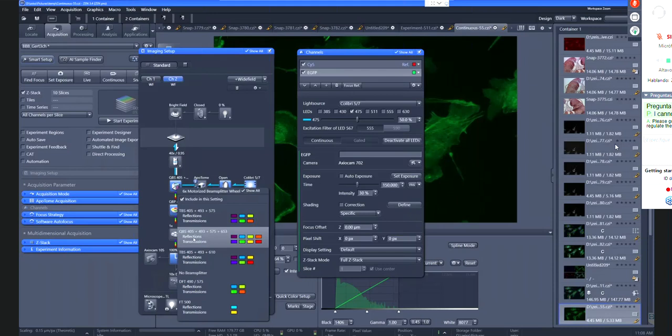Thank you, Kel. So we'll do one last question as we're already over time, which is basically two questions, but for one topic. Can you explain binning further, and is binning only used for live samples or also for fixed samples? You can feel free to use binning whenever you want.